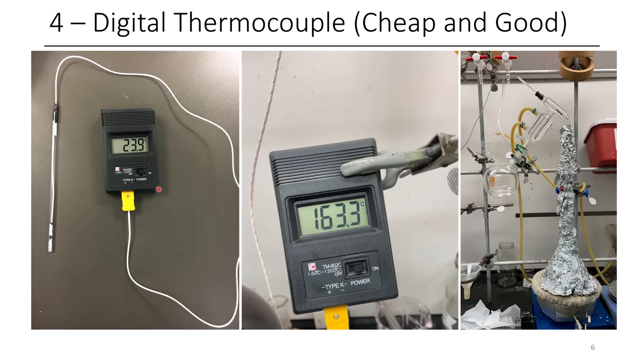Relatively straightforward. I've found that this is much more reliable than the alcohol thermometers and it's much more responsive to slight changes in temperature.